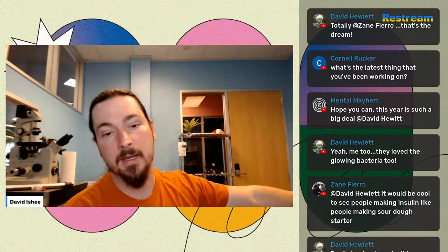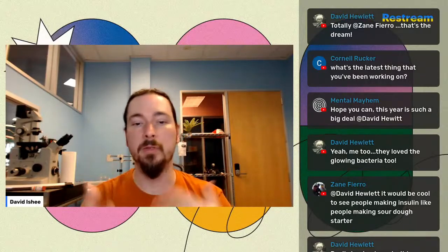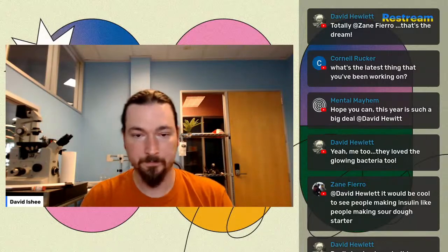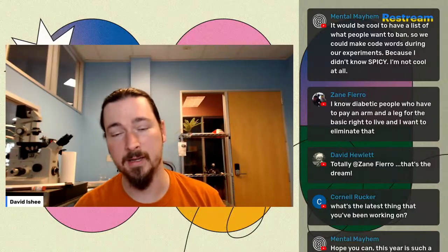Now, I will say this. It's easy to get a strong signal from an enzyme-based reaction, which is the same reason our human cell kit uses an enzyme-based reaction, because even if the expression is pretty low, it'll slowly accumulate more and more of the end product over time. And as long as the end product is stable, eventually you'll see it, right? So even if your infiltration isn't particularly well done, it'll eventually turn red. It may just be really slow. If you were using something like GFP, you may have to do a really, really good job to get a lot of it to express so that it's visible at all. And if you're trying to do some other compound, you may have to get crazy with it to get a high enough expression level to get a clear signal. Enzymes help with that because the enzyme catalyzes a reaction. It's not the end product. So even if you make a little enzyme, it can make a lot of product with time.